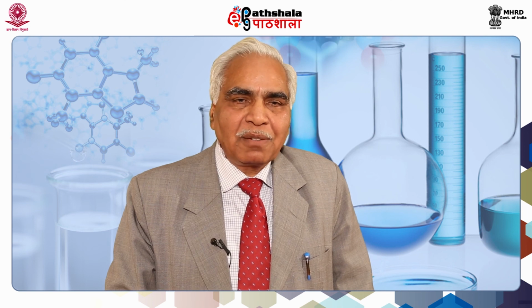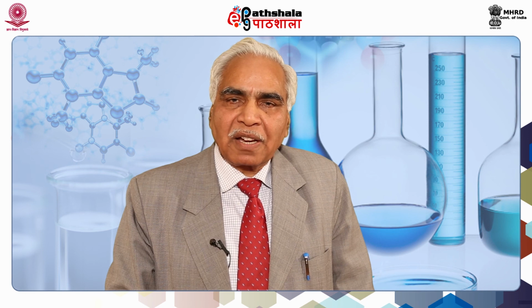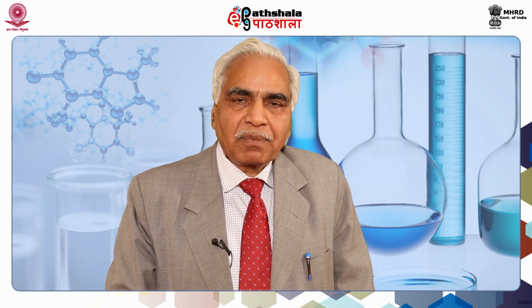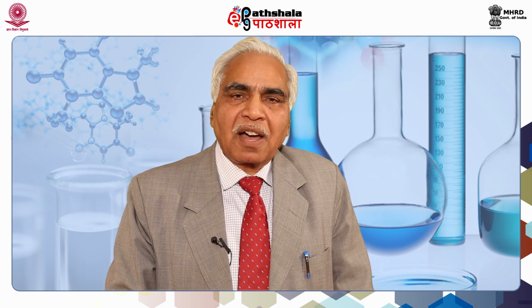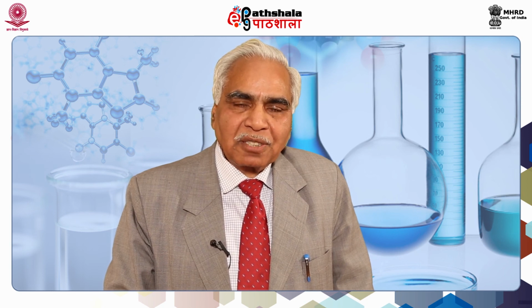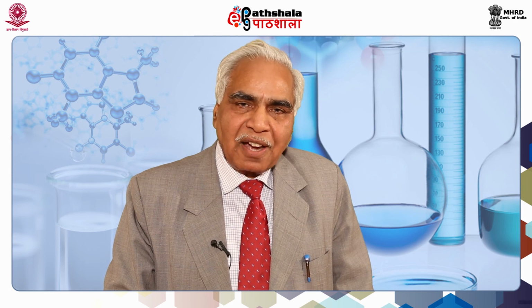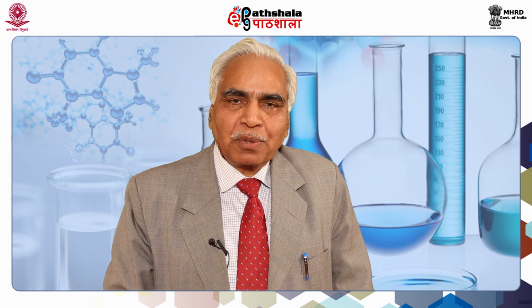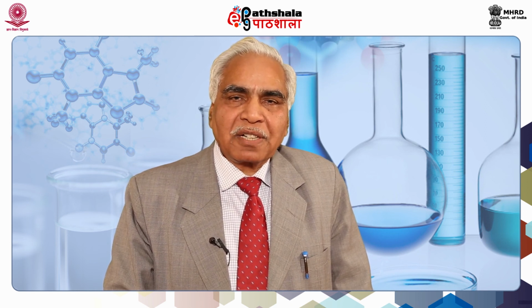This can now even be used in coupled form with SDS-PAGE, with agarose gel, and many other electrophoretic techniques. But we see that this particular electrophoretic technique also uses the concept of chromatography, the number of theoretical plates, which is very large in this technique. So resolution is high and sensitivity is good. All these features give an advantage to this technique over the other electrophoretic techniques.